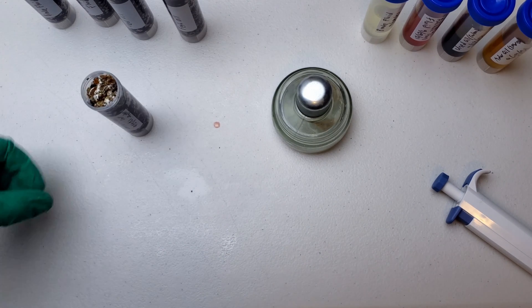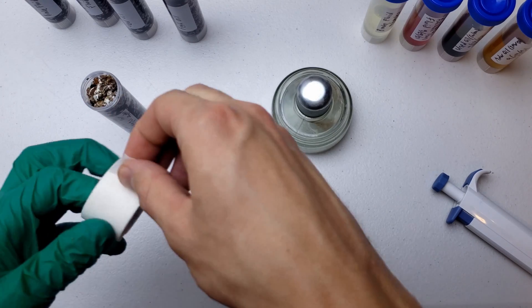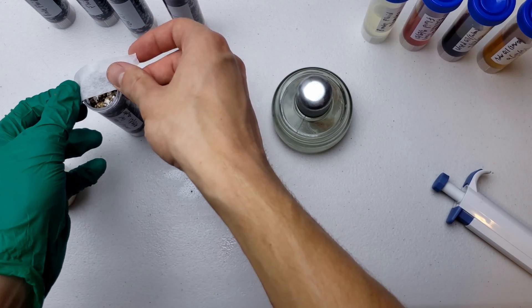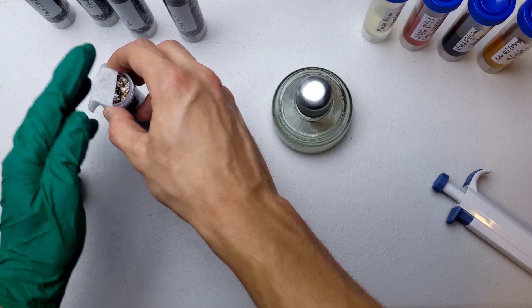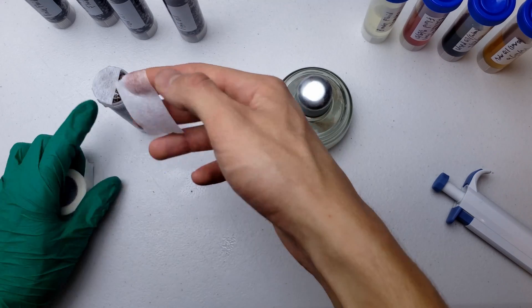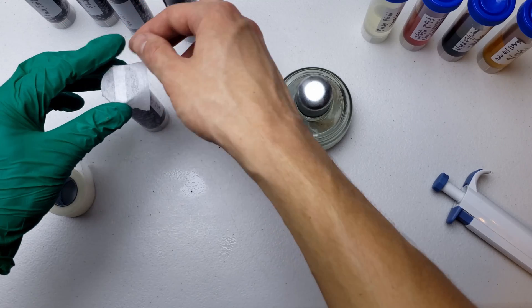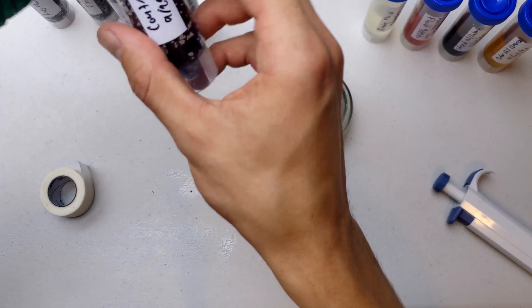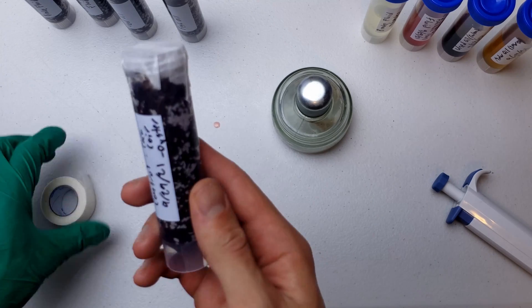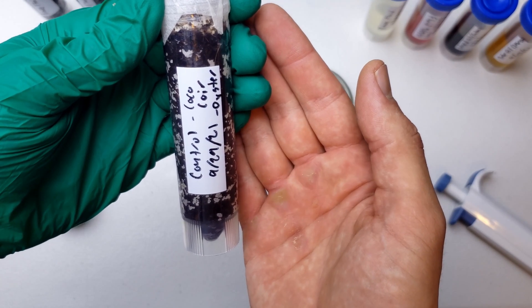For the final step, I want to cover each of these tubes with micropore tape. I love this stuff — it allows oxygen and carbon dioxide to perfuse through, and probably water too, but it doesn't let any contaminants like spores fall in. This is what the control looks like before sealing. I'm going to finish covering all of these and I'll be back in a week or two to see if anything has grown.